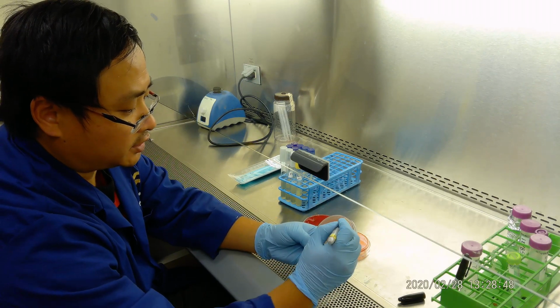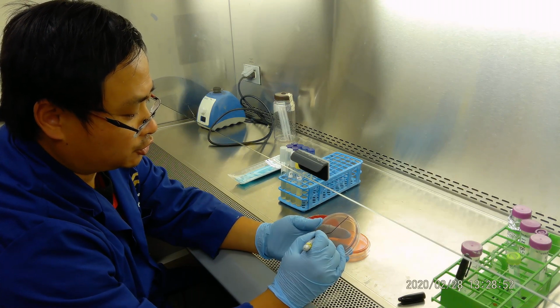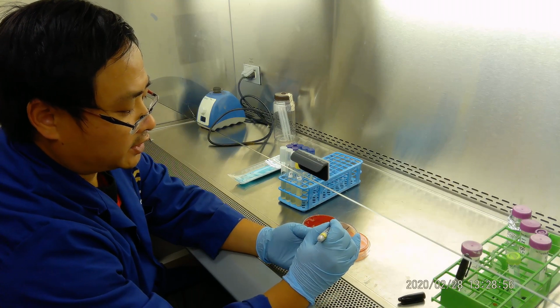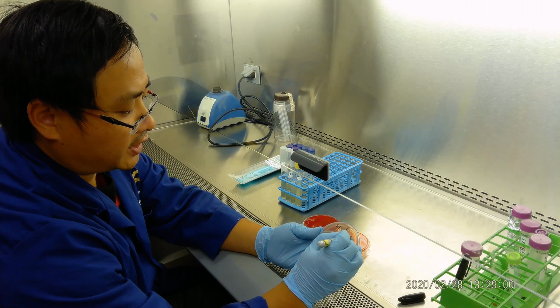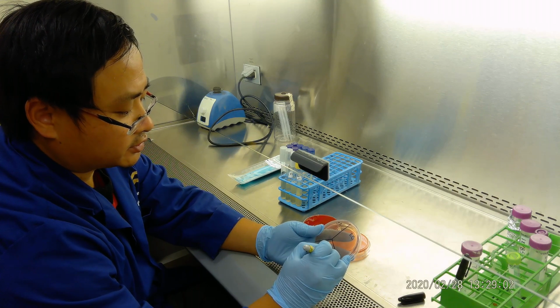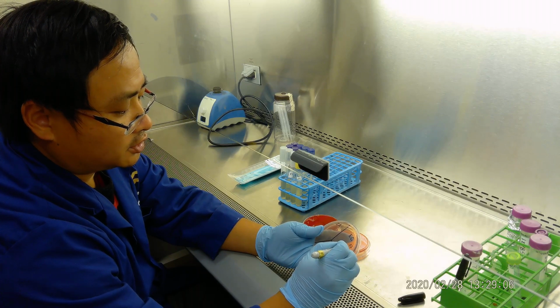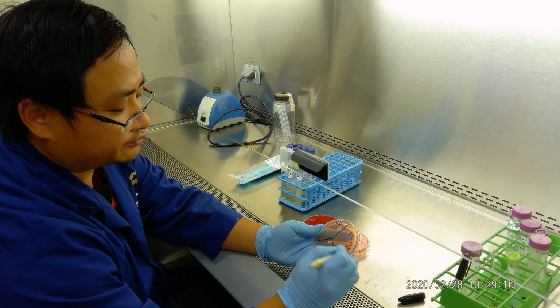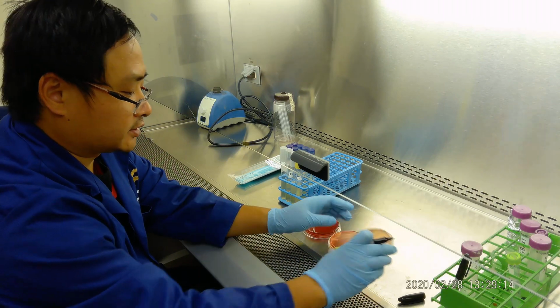We have a MacConkey agar, so we do the label. We will split them into 3 parts. So we want to label them as Staphylococcus aureus, E. coli, and Pseudomonas. Now, of course, you put your initials, date, and also your bench number. Okay, so that is for MacConkey agar.